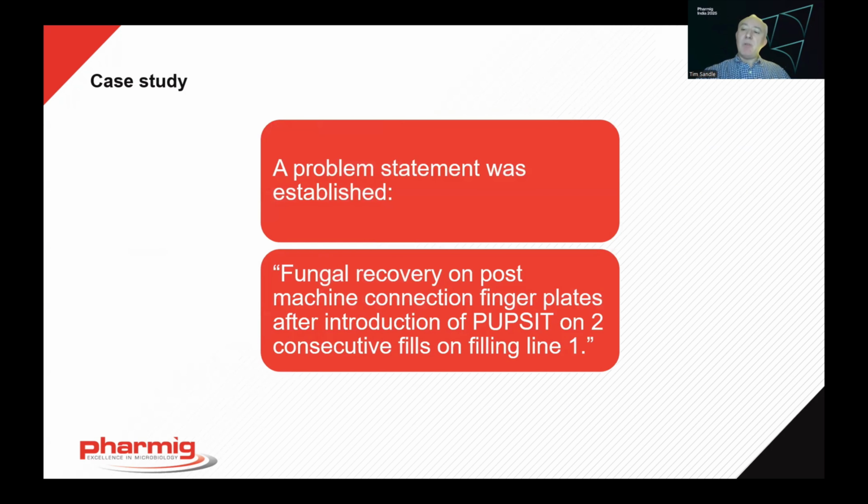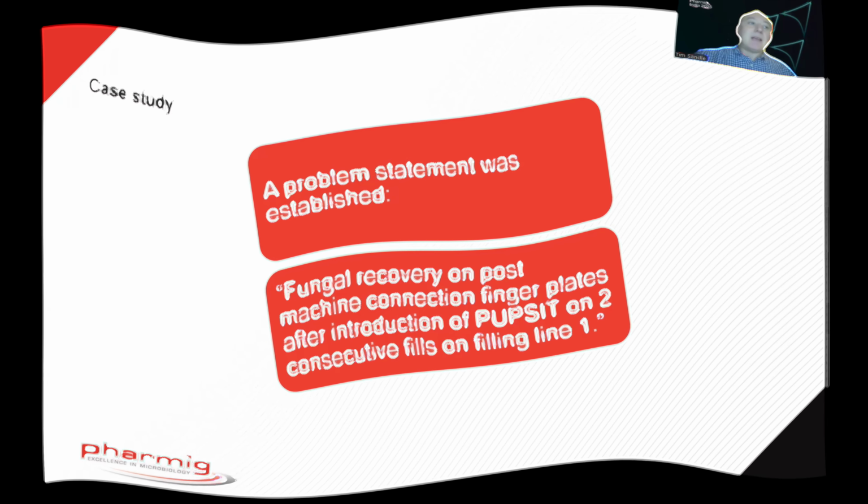So the problem statement that was defined was that fungal recovery from post-filling machine connection was found on finger plates, and this followed the introduction of the PUPSIT filter test. So PUPSIT is pre-use, post-sterilisation integrity testing. It's one of those requirements of EU GMP Annex 1.